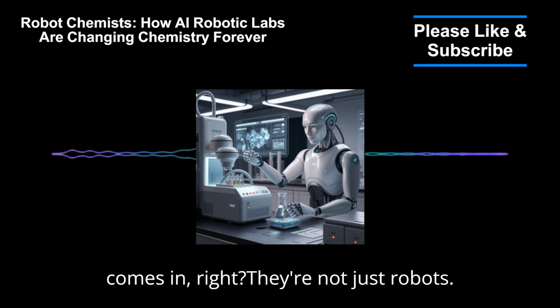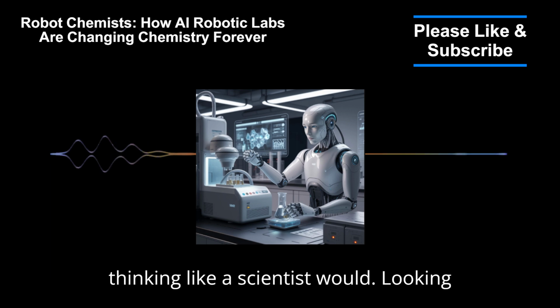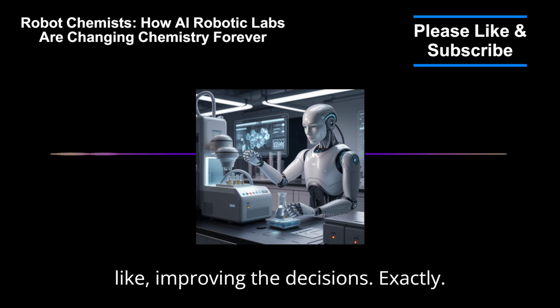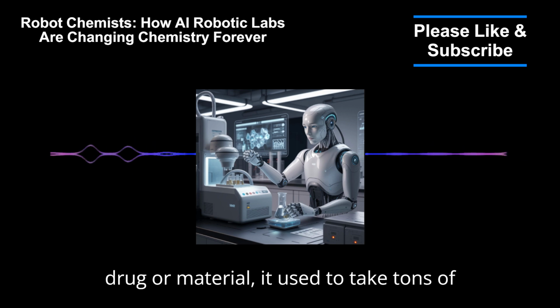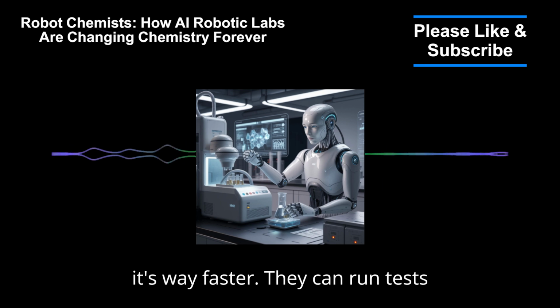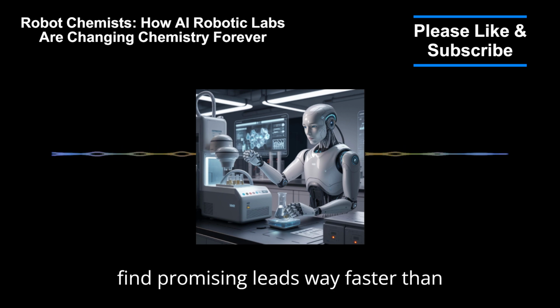They're not just robots, they use something called heuristic decision-making. So they're basically thinking like a scientist would, looking at different data and figuring out what to explore next. They're not just speeding things up, they're improving the decisions. If you're trying to make a new drug or material, it used to take tons of time with people in the lab testing and analyzing results. But with robots, it's way faster. They can run tests all the time, analyze data perfectly, and find promising leads way faster than a human.